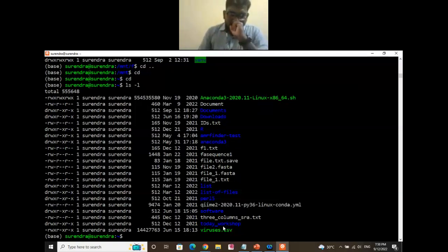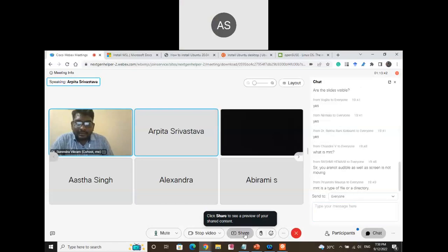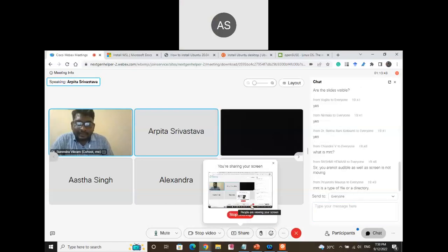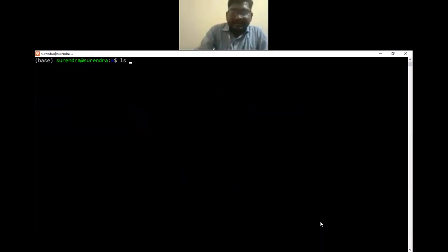Sir, ls /home, what does it mean? That is for the home directory. I'll show. So ls /home.